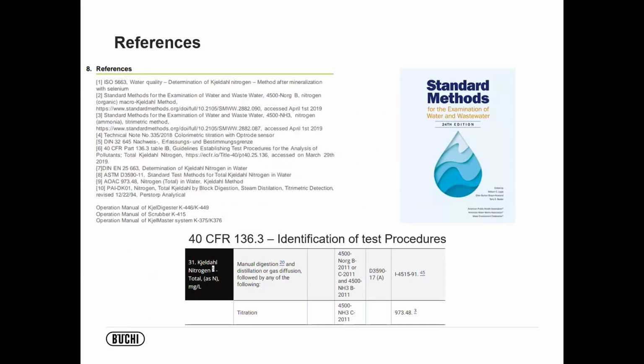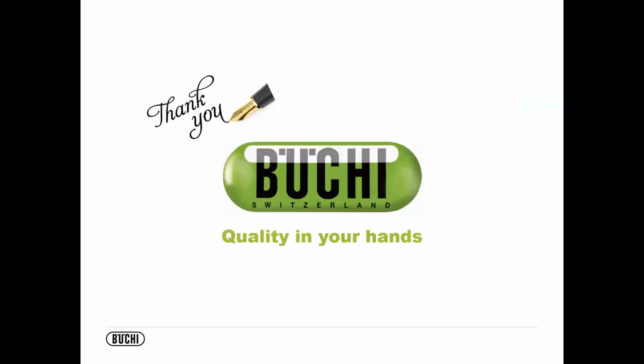Lastly, the references. You can see those again. We really wanted to stay true to standard methods and 40 CFR 136.3. And you can see some of the other methods that we referred to in the application note. And that, my friends, is it.